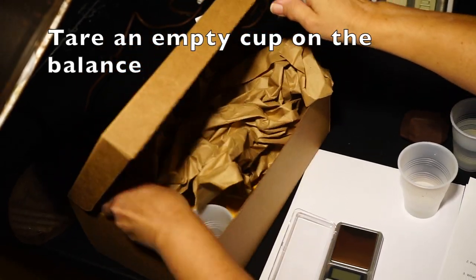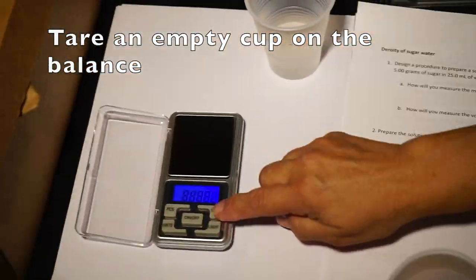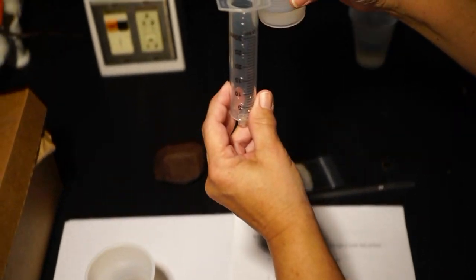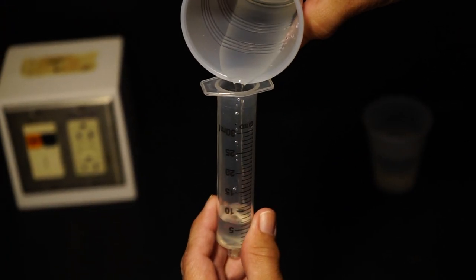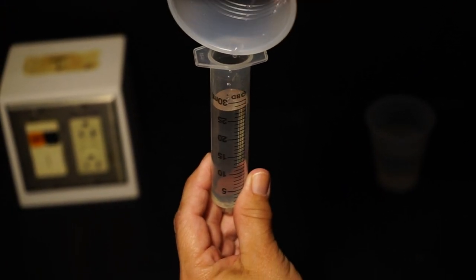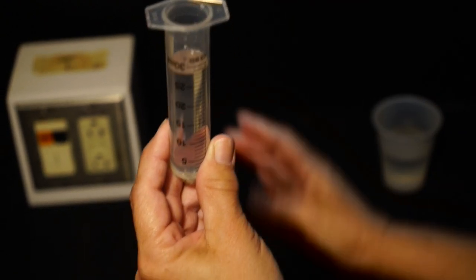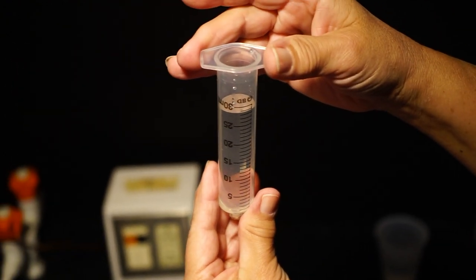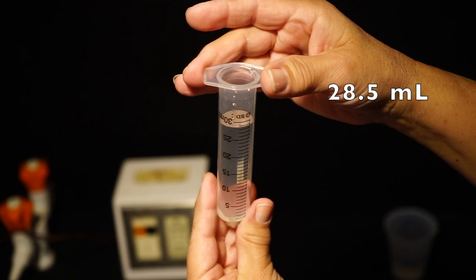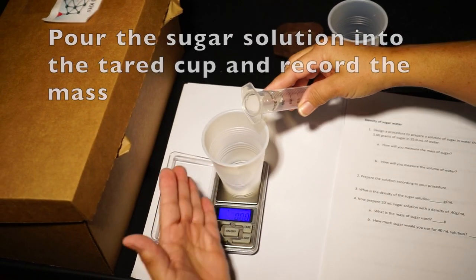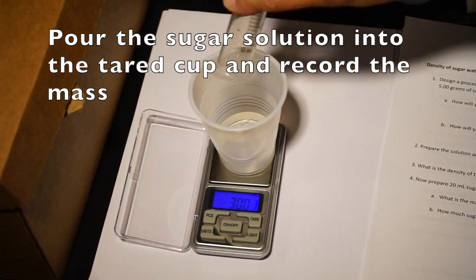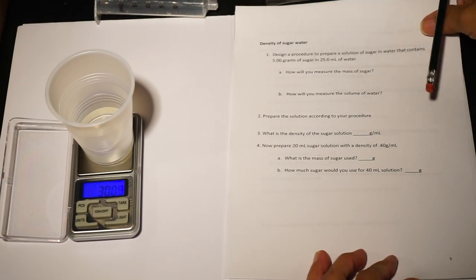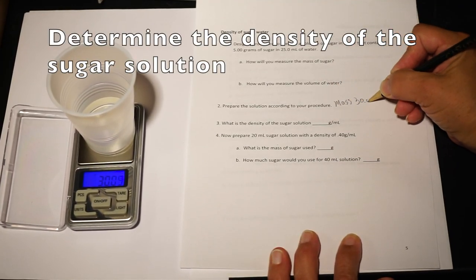Turn the balance on and add an empty cup and tare it. Take your sugar water and pour it into the syringe and measure the new volume. Is it more or less than the original 25 milliliters? Why is this? After recording this volume, pour into the tared cup on the balance and record its mass. Determine the density of this sugar solution.